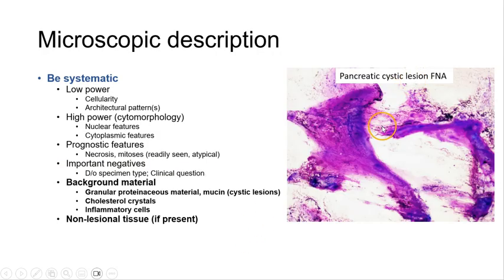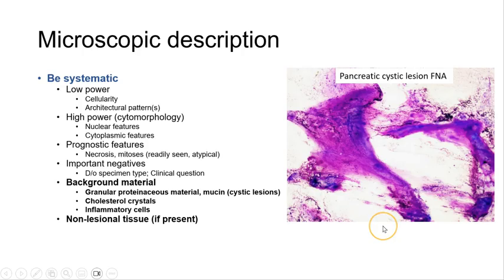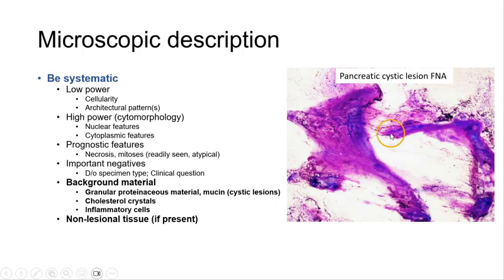Here is an example of very thick mucin in a pancreatic cystic lesion. This appearance is by itself highly suggestive of a neoplastic mucinous cyst — for example, IPMN or MCN (mucinous cystic neoplasm) — even if we do not see epithelial cells.